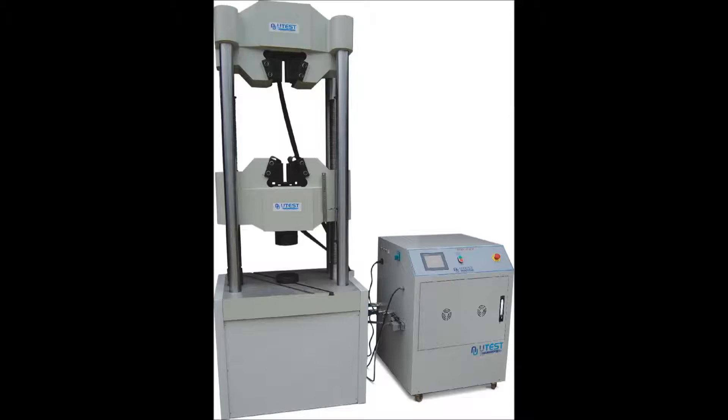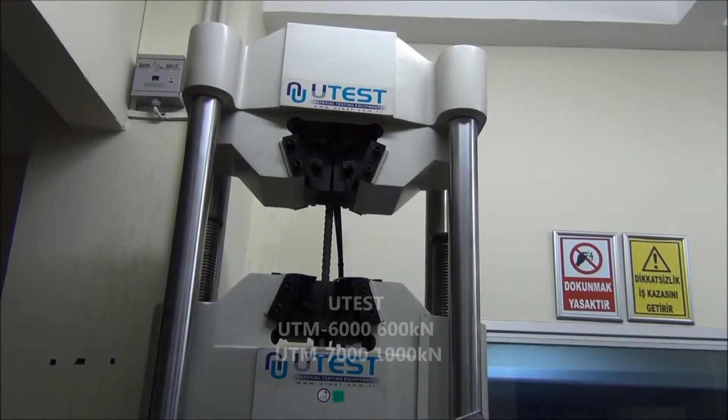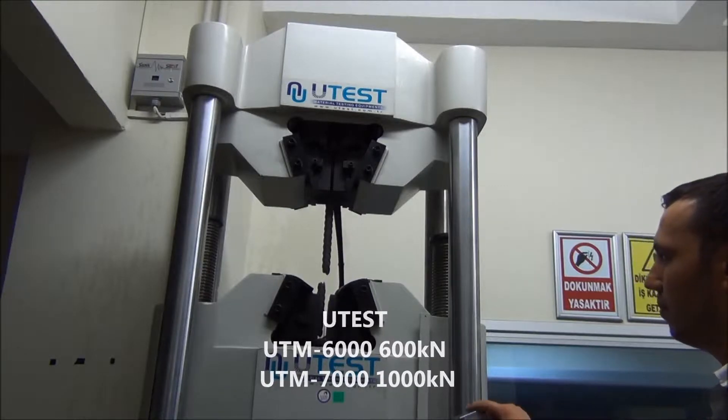UTEST UTM-6000 and UTM-7000 computer controlled electrohydraulic servo universal testing machines are suitable to test various metallic and non-metallic materials, and can carry out tension tests, compression tests and flexural tests. The capacity of UTM-6000 is 600kN and of UTM-7000 is 1000kN.